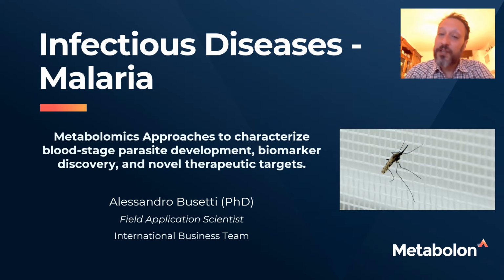Hello, everyone. My name is Alessandro Busetti, and I am the lead field application scientist for the international business team here at Metabolon. And today I'm going to present some research on infectious diseases, and in particular on malaria, showing how metabolomics approaches can be used to characterize the blood stage parasite development, conduct biomarker discovery, and identify novel therapeutic targets.